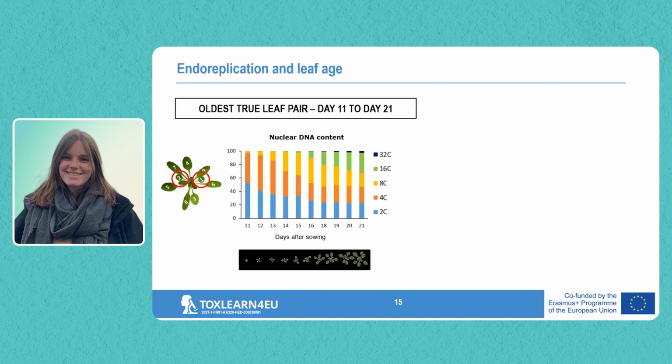So what I did in my research is I grew Arabidopsis plants. We typically do this in a hydroponic cultivation system. And at some point, the leaf rosettes, as we call them, will look like this. And you will see here that I numbered the different leaves.